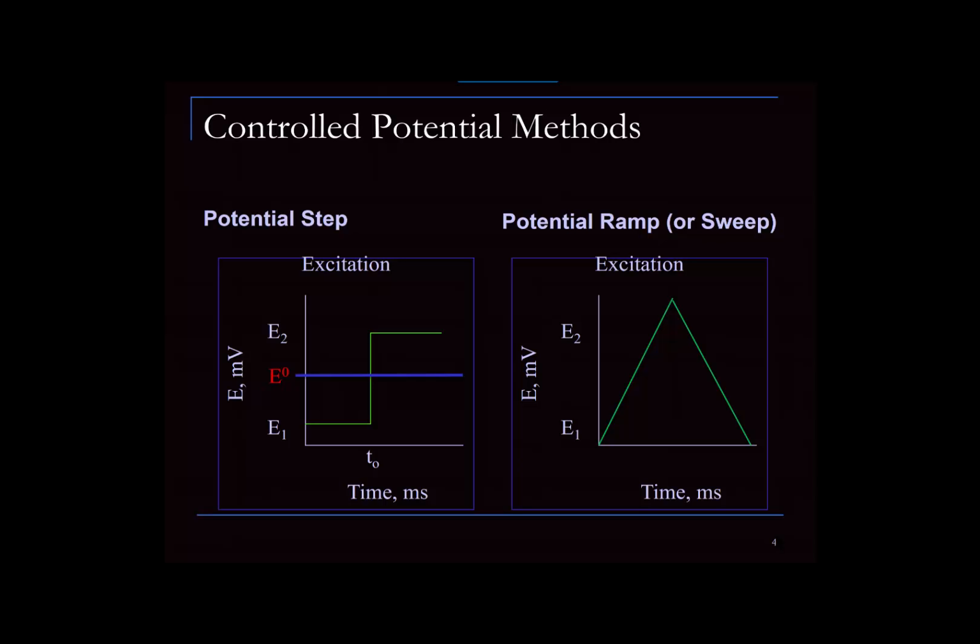in a practical way, and so your experiment is a tiny bit flawed, and that's the reason that we have chronocoulometry. If you integrate the current as a function of time, what was a minus for the chronoamperometry experiment becomes a plus for the chronocoulometry experiment as the charge builds over time.